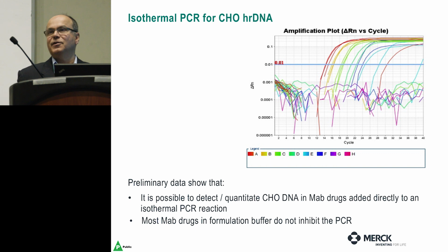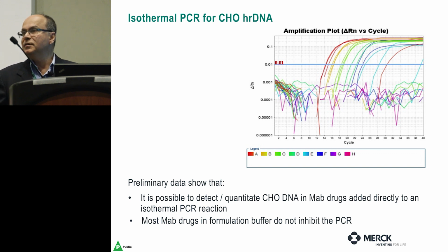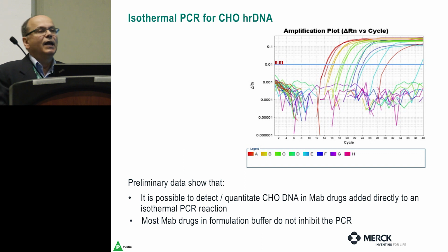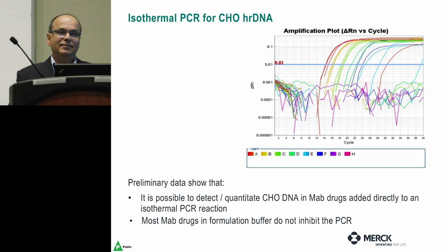In the beginning of the process, we have to bake the milky droplets in a PCR well at 95 degrees for a few minutes. Now the droplets are stable, so the phases don't get mixed up. Here we are talking about a lower temperature where the protein does not precipitate. Unfortunately, the droplets are not stable.